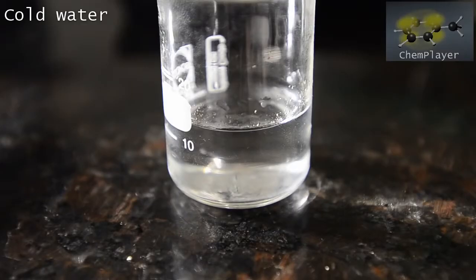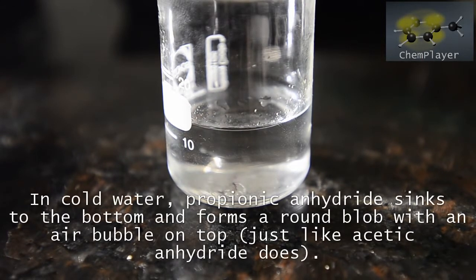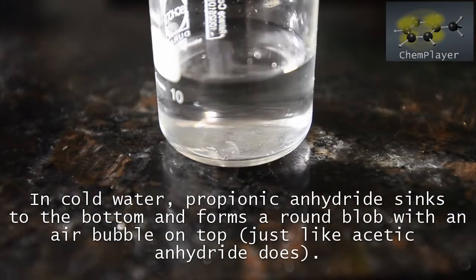Here's a little water in a beaker. Let's drip in some of the product. You can see that it's insoluble in cold water and sinks to the bottom in a round blob. Very similar to acetic anhydride.